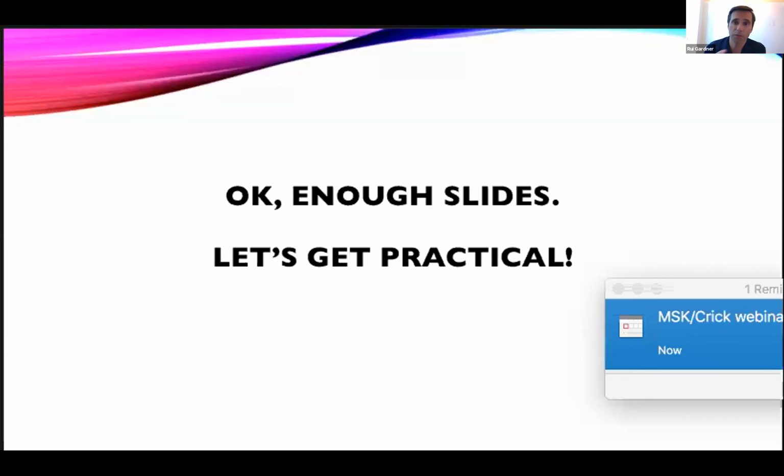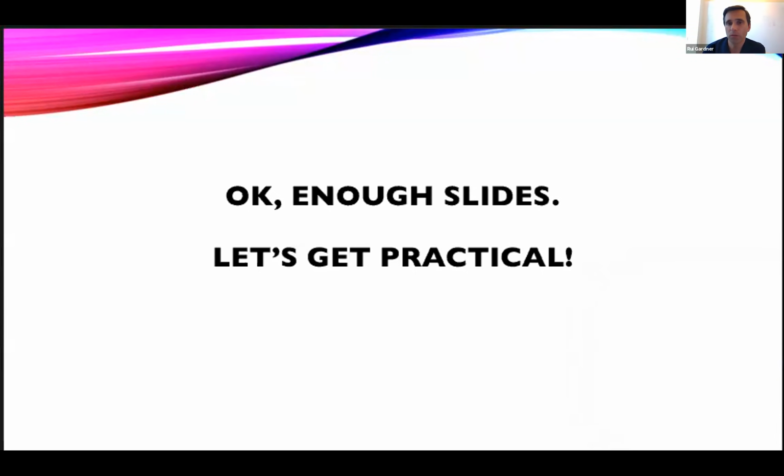Yeah, sorry. Do you want to answer, Derek, also this question here of when running CS&T, if the machine actually makes adjustments so that it reaches targets in the baseline report, and what are the ways in which these changes are made? Yes, I mean, I suppose one of the things that we will do in the next webinar is look at changing the voltage and how that affects the signals that we're getting. But that, in effect, is what CS&T is doing.